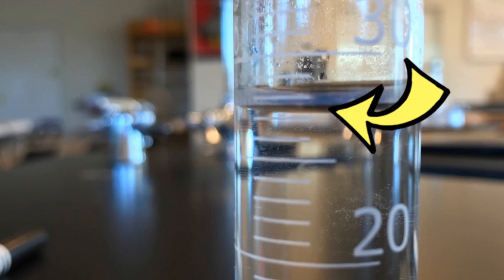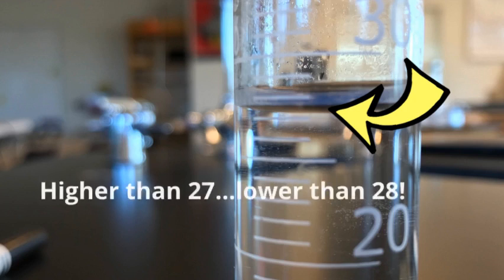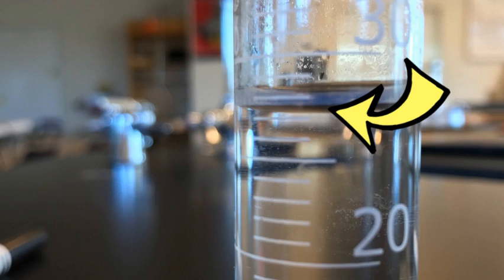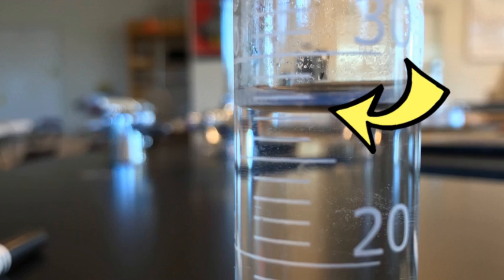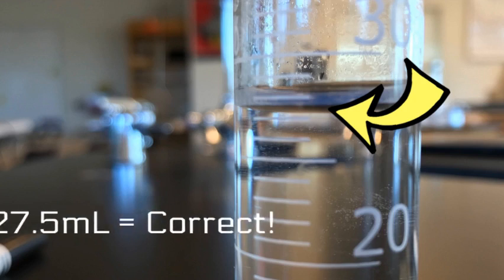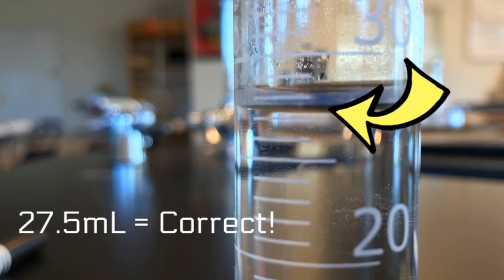And so for this one, if we count up, you can see that we're at, we are right between 27 and 28 milliliters. Okay. So if you write that this measurement is 27 milliliters, you are lying because it is over 27 milliliters. If you write that it's 28 milliliters, that is also wrong because it is not yet there. It's not there yet. So your measurement is in between 27 and 28 milliliters. Therefore, that's when you estimate the digit. And it looks to be pretty much right between the two. So I'm going to write 27.5 milliliters.